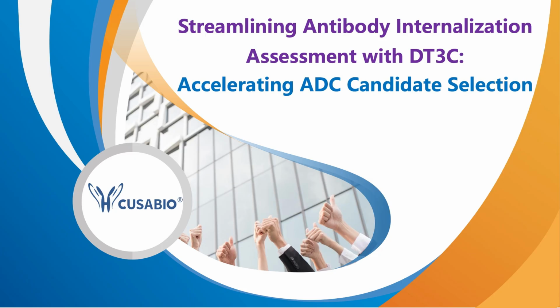Today we will talk about recombinant protein DT3C, and how we can use the DT3C to perform the antibody internalization assessment, and how we can use the DT3C to accelerate the selection of ADC candidates.